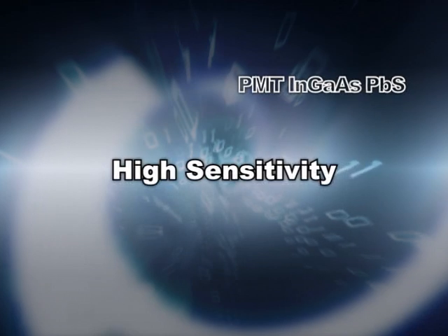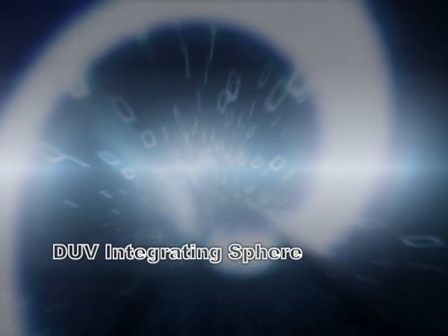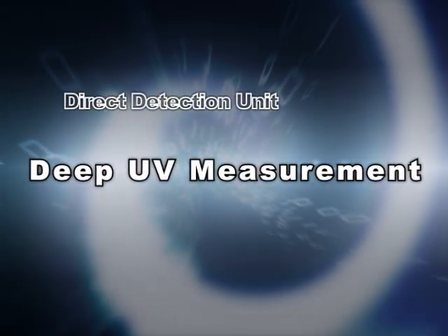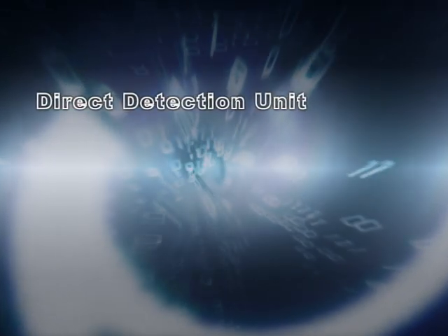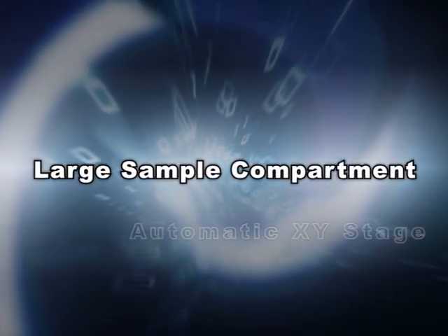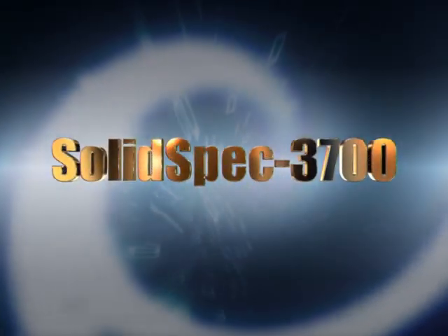In the fields of optics, flat panel displays, and semiconductors, where international competition is becoming increasingly fierce, speedy product development is critically important, generating stronger demands for even more accurate and efficient analytical methods. Responding to these demands, Shimadzu has developed a revolutionary UV-visible NIR spectrophotometer, the SolidSpec 3700.